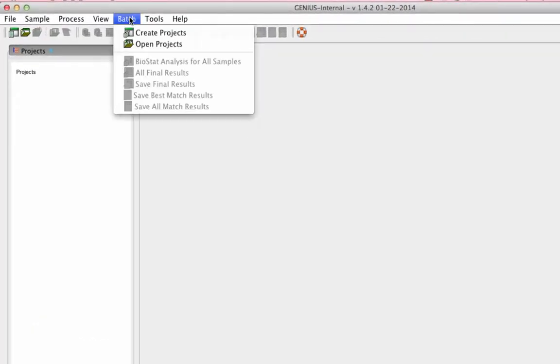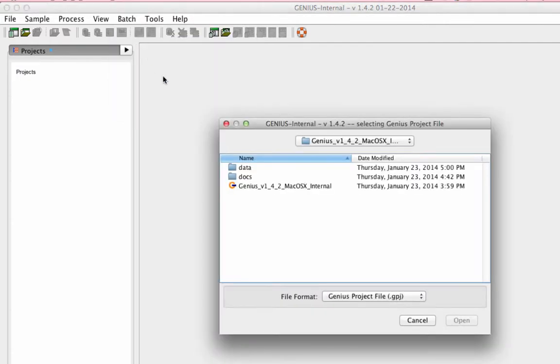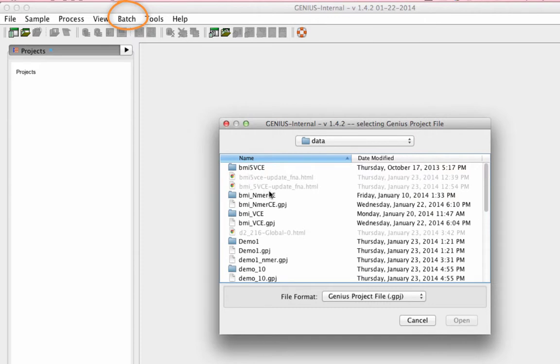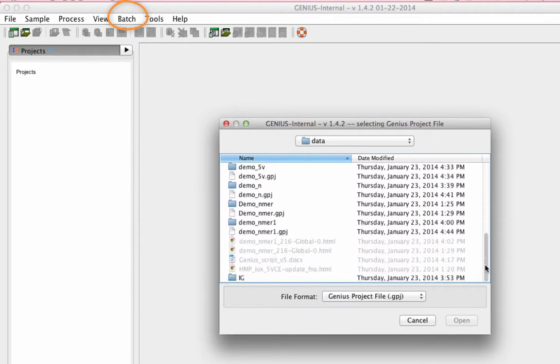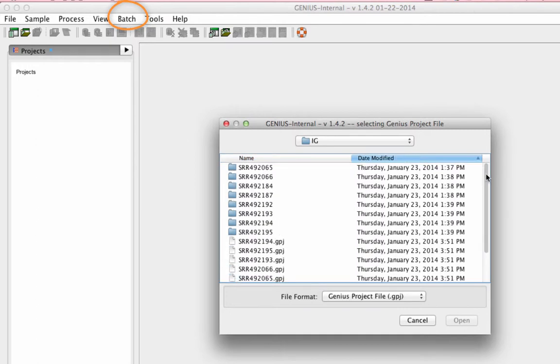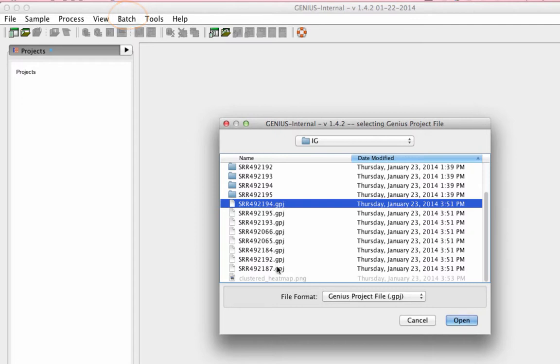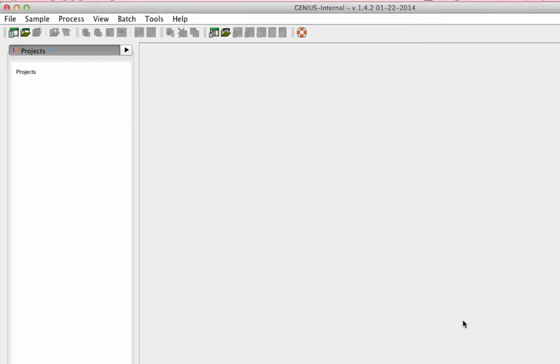We just looked at how you would work with an individual sample. Typically, you have many samples to run. Genius has a batch mode that allows you to load those samples and run them at the same time. Not only that, you can also do comparative analyses between multiple samples to indicate informative, correlated, or uncorrelated features.